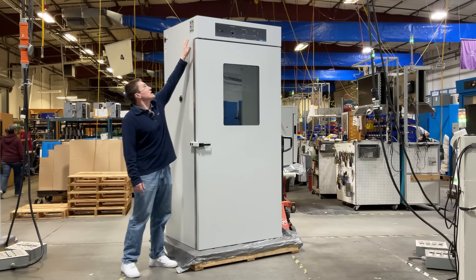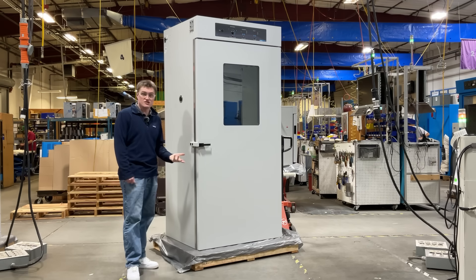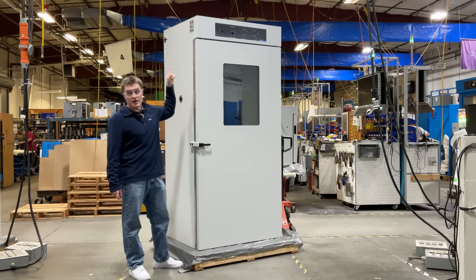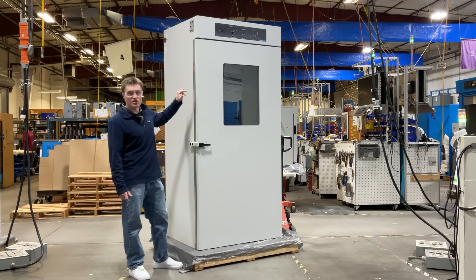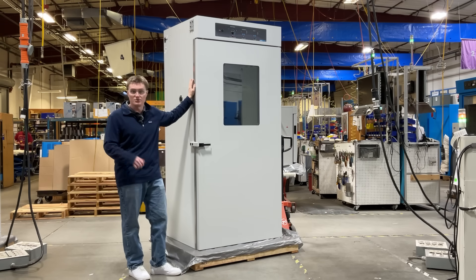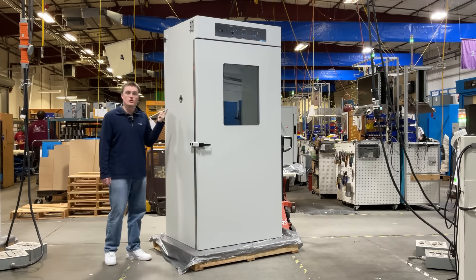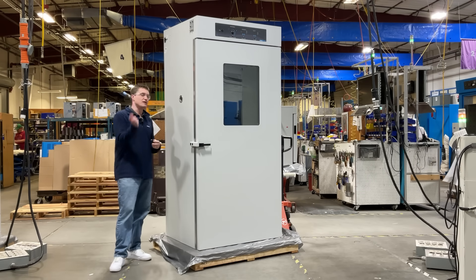Moving below, we have the two gas ports. First, the CO2 in — this is where you connect your CO2 gas supply. And the CO2 sample port, which will allow you to monitor and verify the CO2 level within your chamber, as well as perform calibration functions. Lastly, you have a one and three quarters inch access port should you want to pass anything into the chamber.